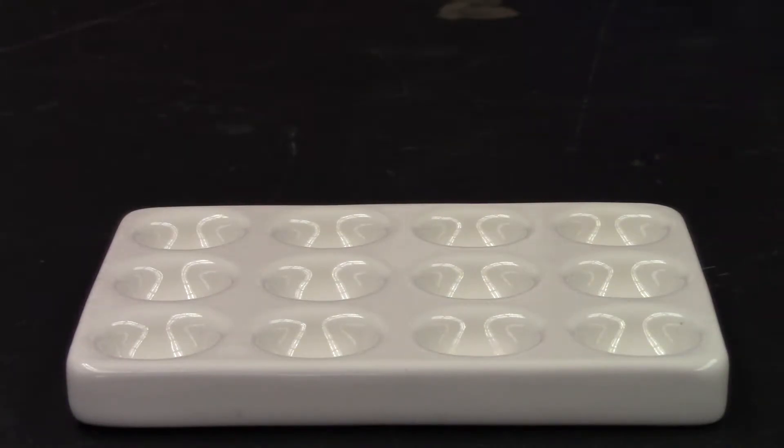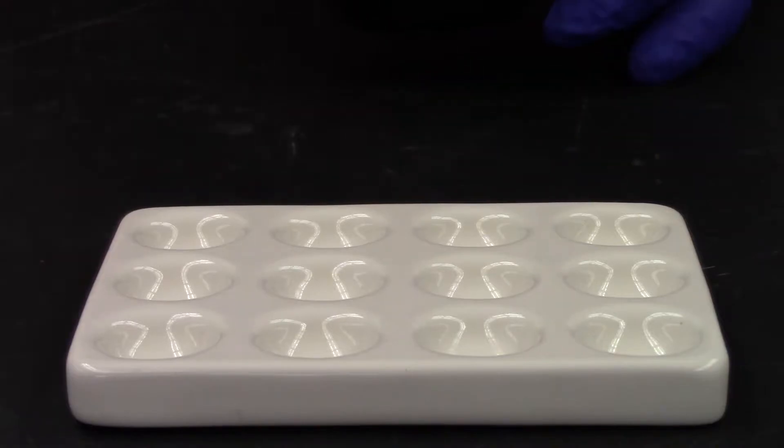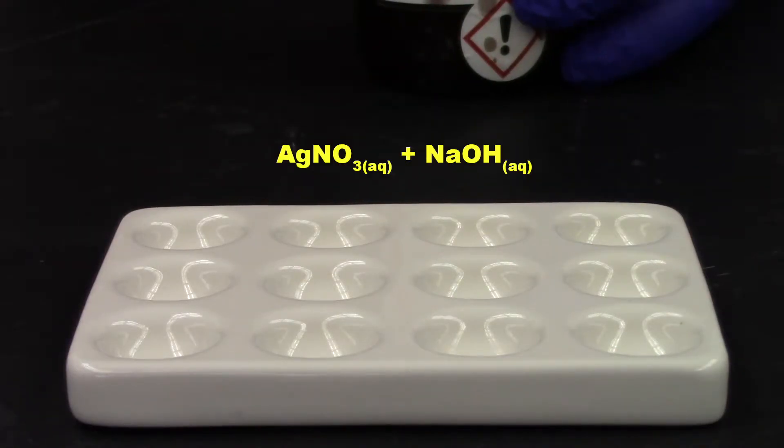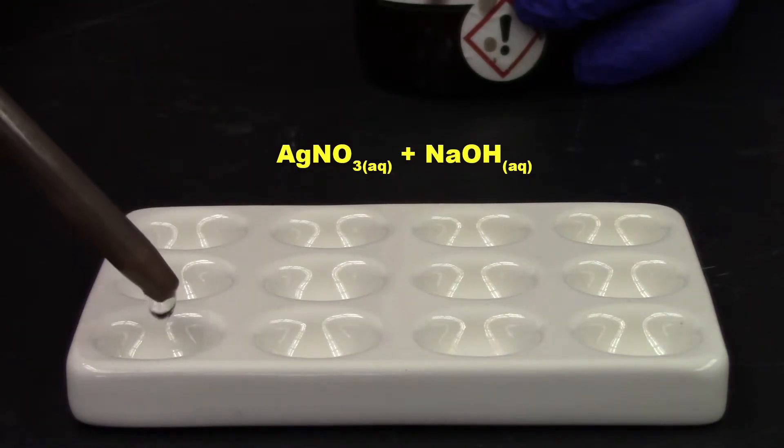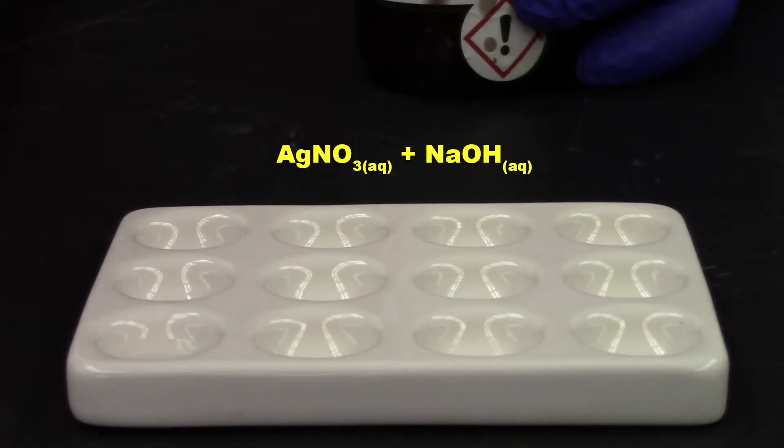In part two, we're going to do a whole bunch of different chemical reactions. So the first reaction we want to do is we want to mix in some sodium hydroxide with a little bit of silver nitrate. All right. So let's add the silver nitrate first. Take five drops of that. Put it into this well.